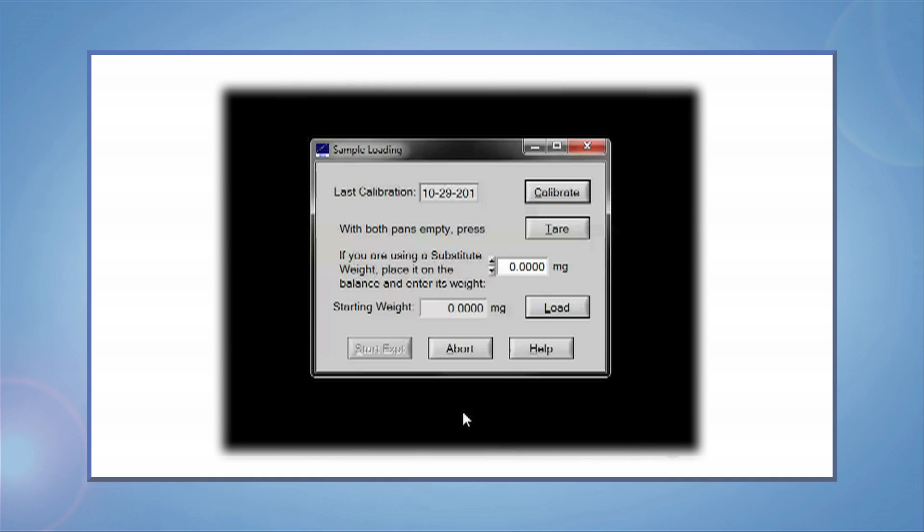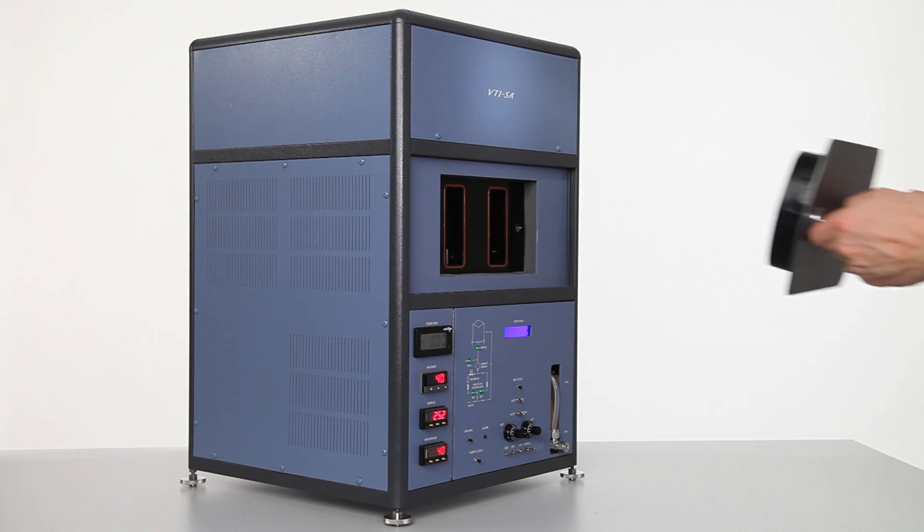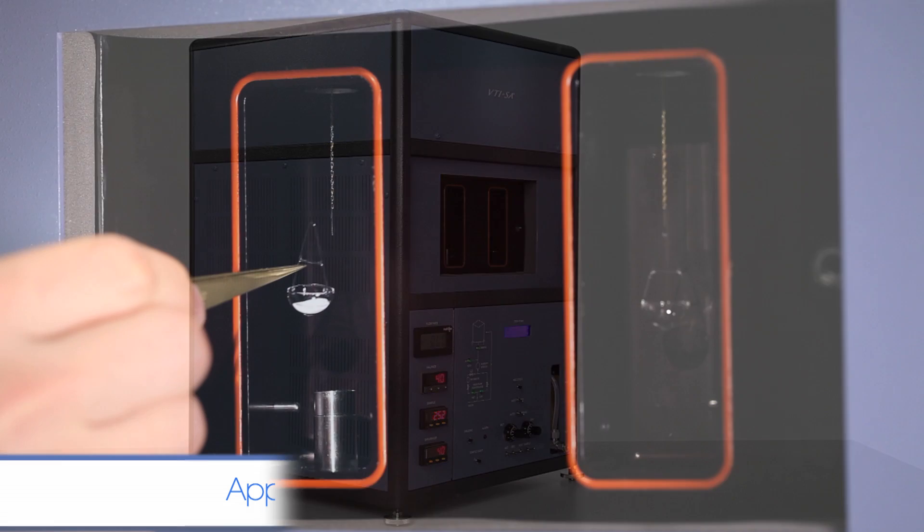Wait 30 seconds, then click Tare. Once you have a stable reading, open the chamber and load the sample.